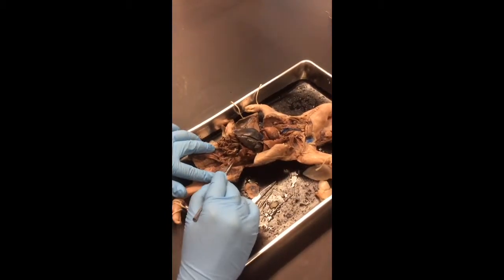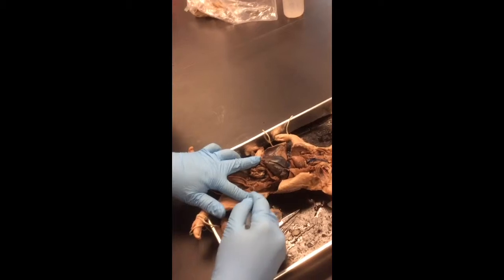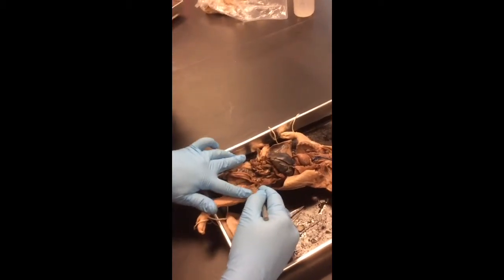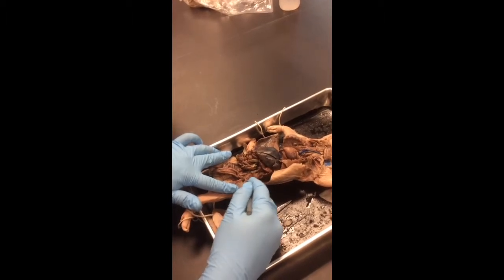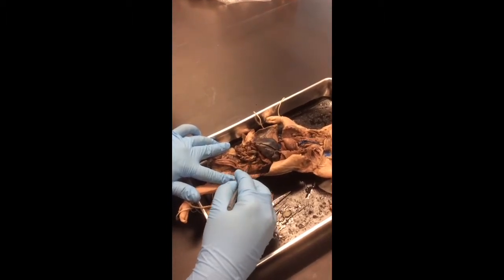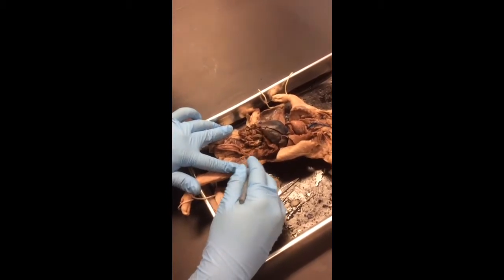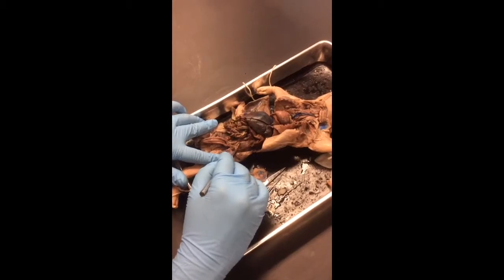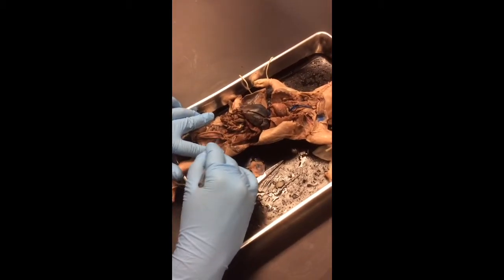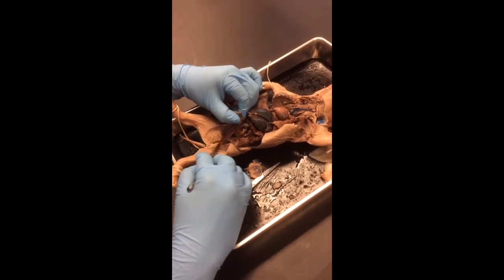Third column, right? Kidney, the bean shape, there's two of them. Ureter is the tube that comes from the kidney and extends into the urinary bladder. If you see a tube and you can't tell what it is, try to just follow it. See what connects it. If you're not sure what it is, try to find where it connects to. So the urinary system goes from kidney, ureter, to the urinary bladder, to the urethra. Okay, female urethra right there.